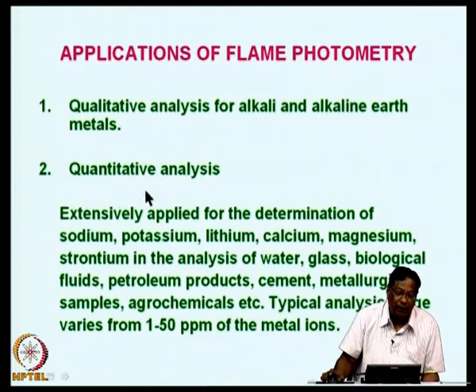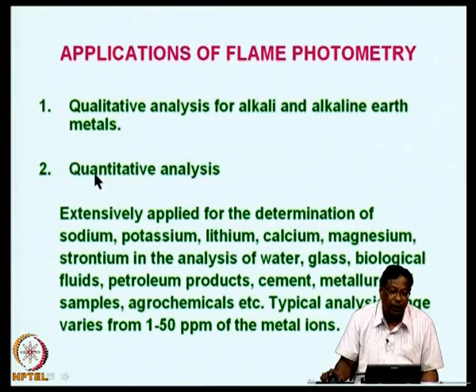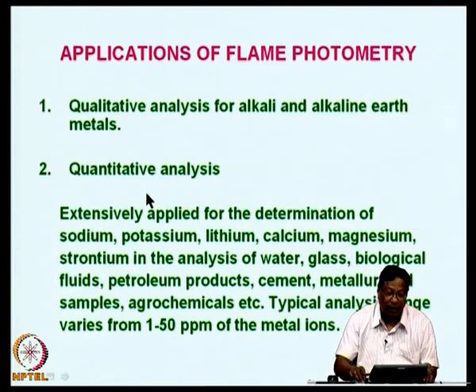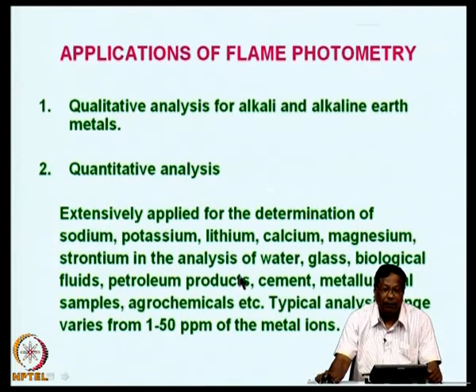Then the other way is quantitative analysis. This we have been discussing, how to do it using standard solutions. So, the quantitative analysis is extensively applied for the determination of sodium, potassium, lithium, calcium, magnesium and strontium. The analysis matrix can be water, glass, and biological fluids like plasma, body fluids, urine, etc.